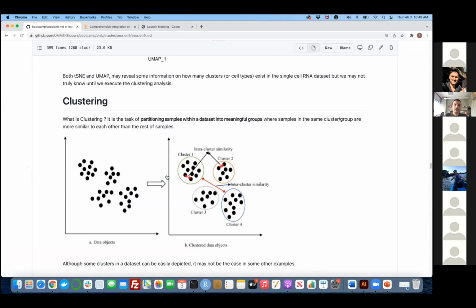Each dimension in a data clustering analysis is actually representing a gene expression, or some transformed gene expression representing the expression of all the other genes that are correlated with it, right? So what we are expecting is that if we have done a really good job reducing the dimensionality of this data, the distance between two cells that have the same cell state or cell type will be very close to each other, as opposed to cells that do not have the same phenotype or expression profile, which will be really far away from each other.